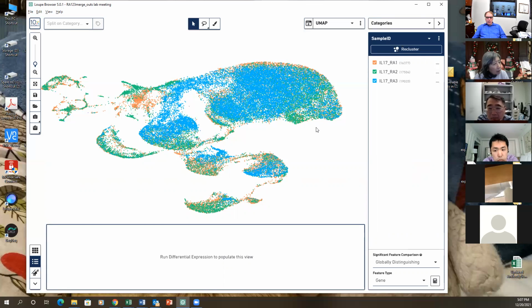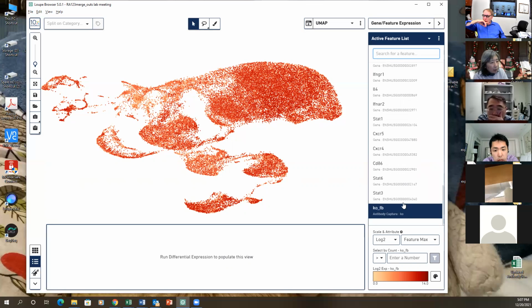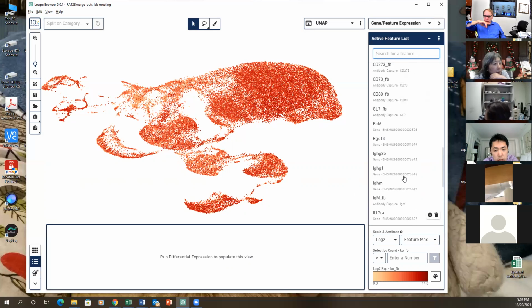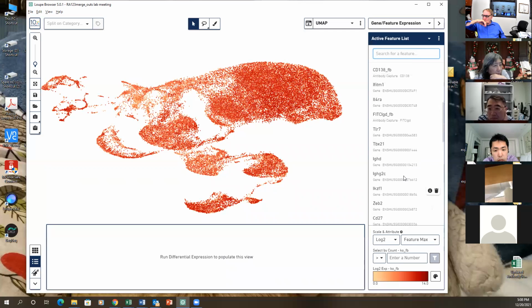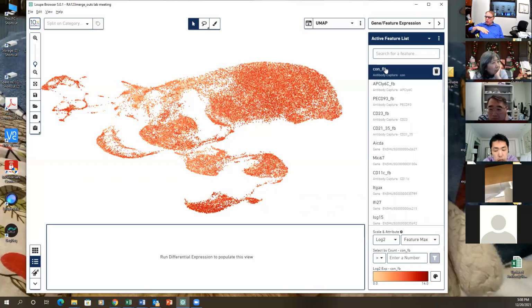Yeah, it does. IL-17R, the green. But we don't know which one, right? Because this could be a wild type, could be a knockout, right? Wait a minute. How could you say that? Can you go back? No, because that number 2 came from both groups. Oh, really? Let's see. So IL-17, this group 2 has both. So I think it's from both groups.